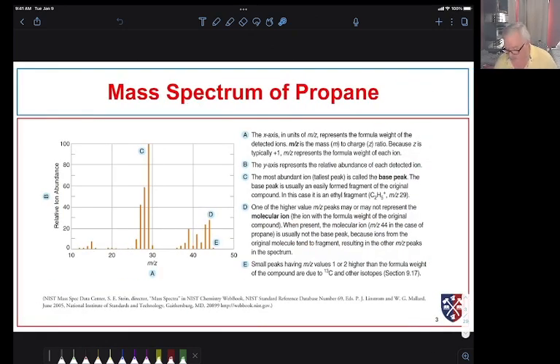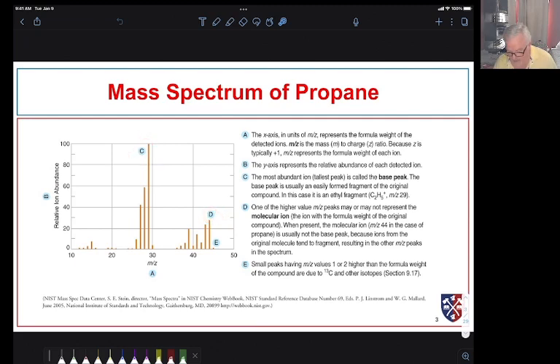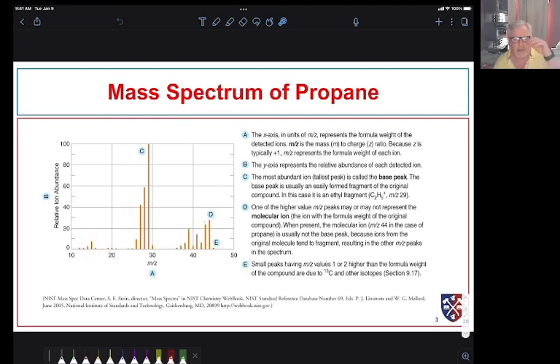Looking at the mass spectrum of propane, we see the molecular ion. The largest peak — the base peak — is the ethyl cation, and we also see evidence for the methyl cation at exactly 15 mass units. There are lots of other peaks we could identify with further calculations, but what we're really trying to do is confirm that our sample was propane.